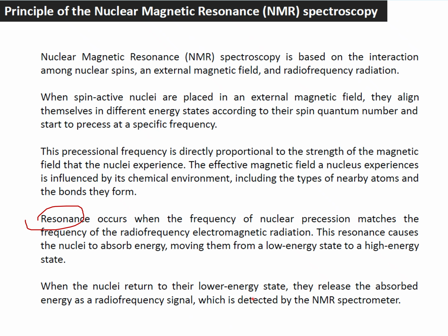This is the basic scenario seen in any other spectrometry. This phenomenon is also observable in UV spectrometry and IR spectrometry. So this is the overall concept of NMR spectroscopy.